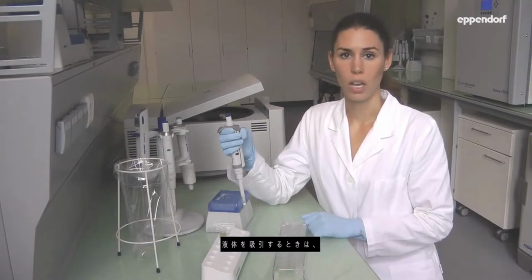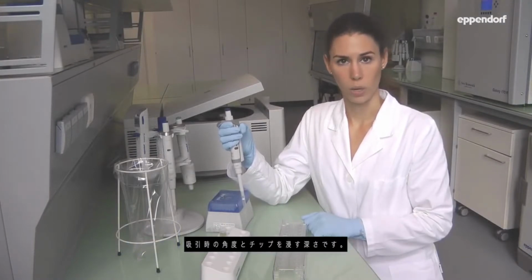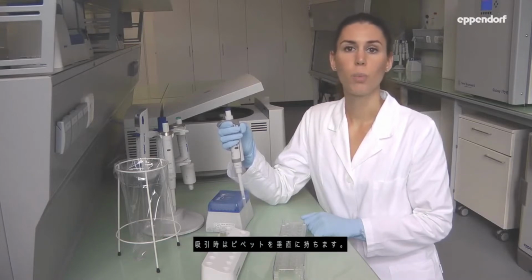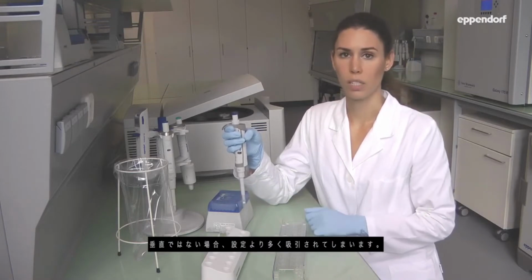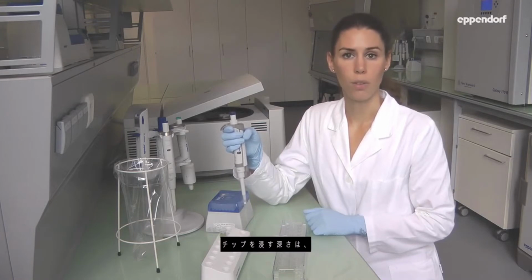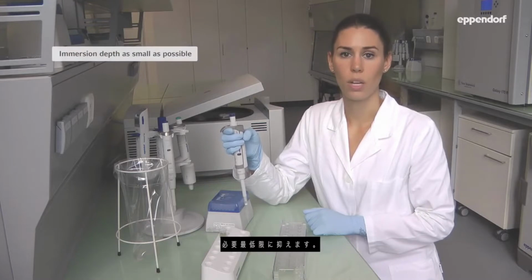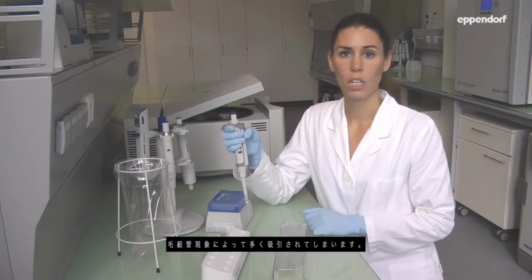When aspirating liquid, two factors influence accurate liquid uptake: the aspiration angle and the immersion depth. The aspiration angle should be vertical, otherwise too much liquid is aspirated. The immersion depth, meaning the depth of the pipette tip inside the liquid, should be as large as necessary, but as small as possible. If the tip is immersed too deeply, additional liquid can be easily aspirated due to the capillary effect.